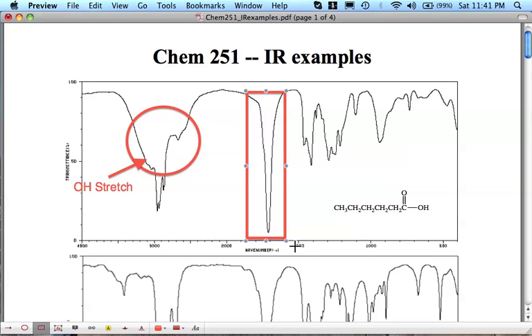So if we go here, this is 1,500, that's 1,600, and that's 1,700 right there where my cursor is. So you can see that this carbonyl is just slightly above 1,700. That's a very common place to find a carbonyl. Carboxylic acids, esters, aldehydes, ketones all absorb almost exactly that same place. I would say 1,700 to 1,750 reciprocal centimeters is about where those come.